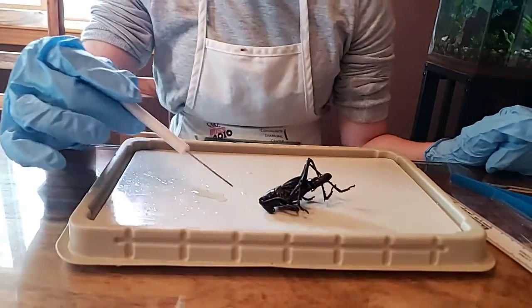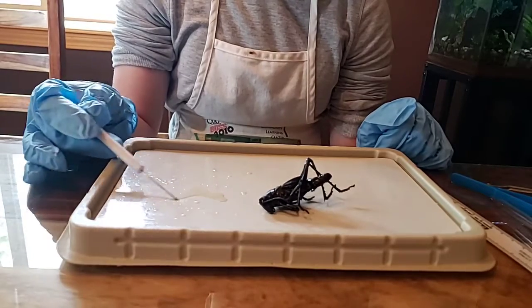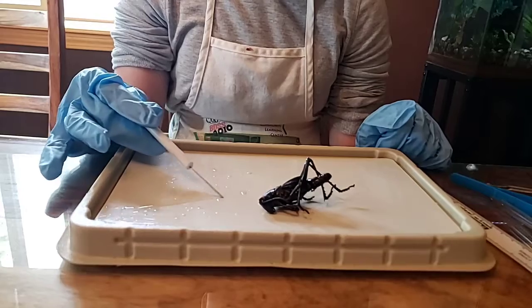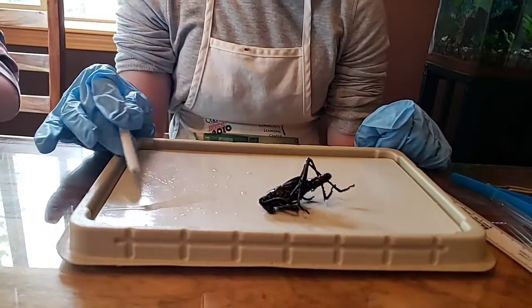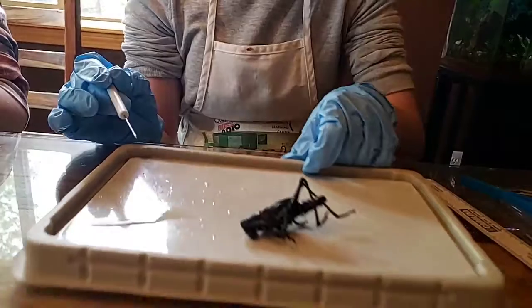Right? And for anybody who wants to dissect a grasshopper, you can get a basic grasshopper out of your yard to do this. These ones, though, are raised for dissection, so they're gigantic. But all grasshoppers would have the same anatomy. Just go in your yard and catch a little bug. Tanley, can you put the grasshopper close to the screen so that we can see those eyes? Nope. You need to lift it up.